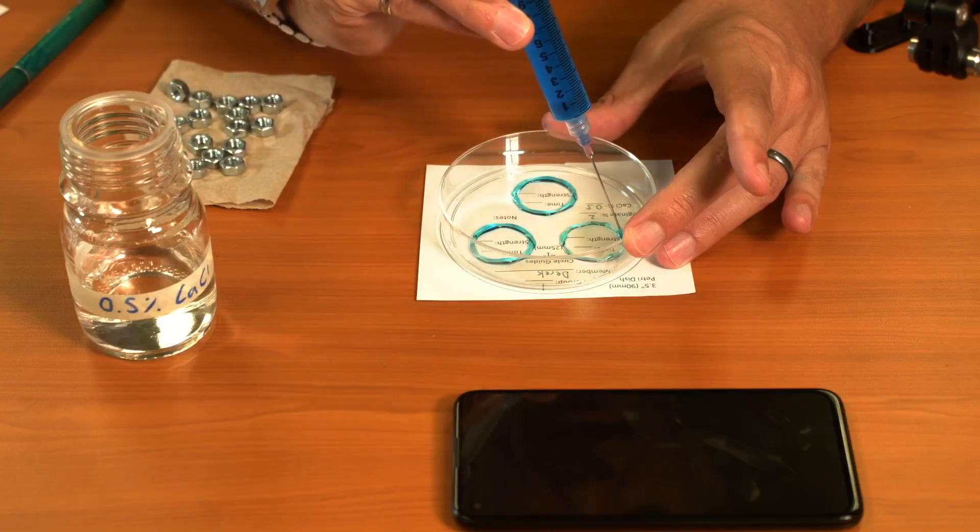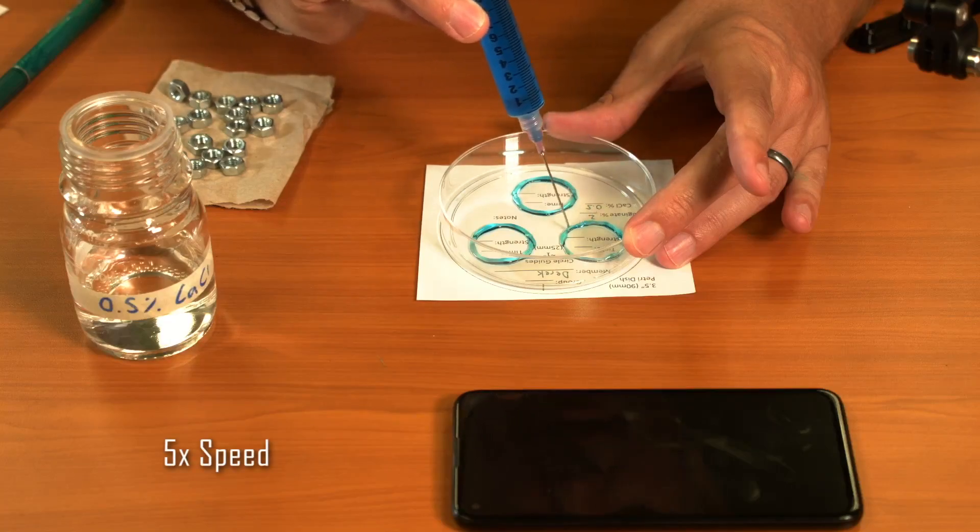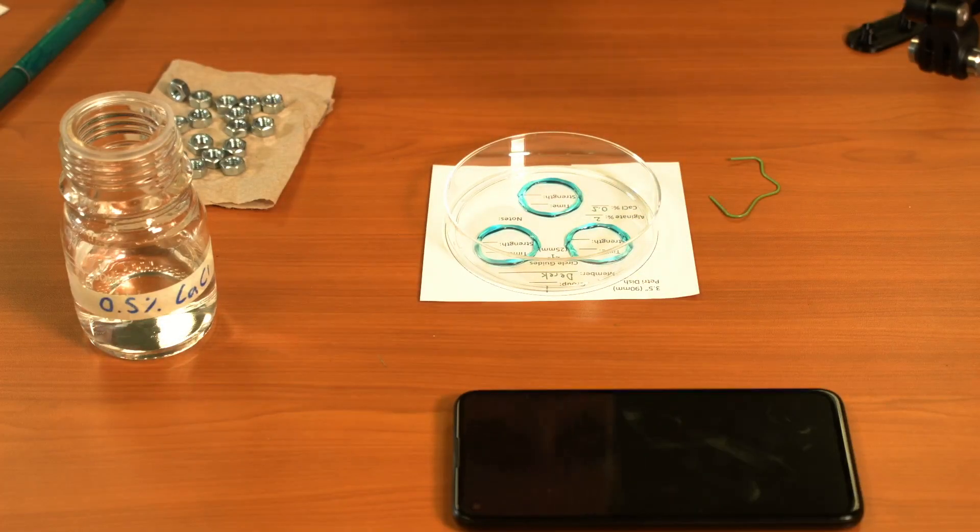My first one here is actually quite a bit smaller than my second two, so I'm going to fill it in a little bit more. Once you're happy with your circles and you've got them all reasonably consistent, put your syringe to the side.